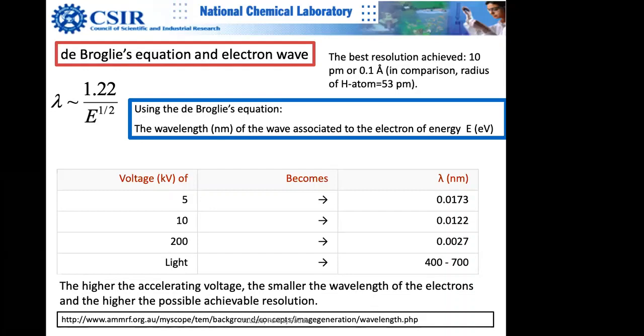But when the finest of the electrons enter a thick sample, they start losing their energy. Most of the energy is lost in the phononic contribution, and the number one killer is the plasmons. Plasmons are generated, then come phonons and everything. As you know, these energies are very subtle in comparison to the energy of the electron, 300 kilo electron volt versus a few electron volts required for plasmon creation. But that becomes very critical when you are talking about this resolution.